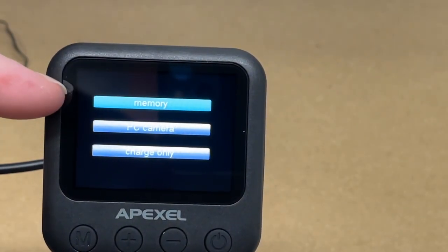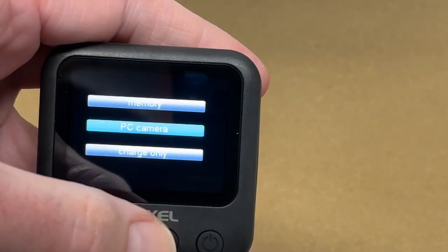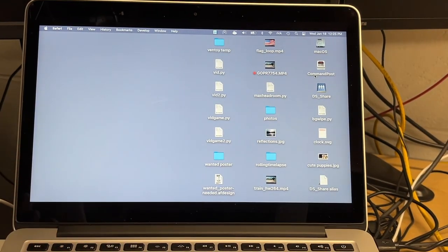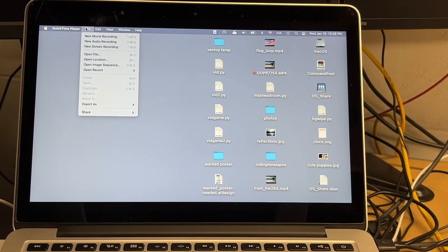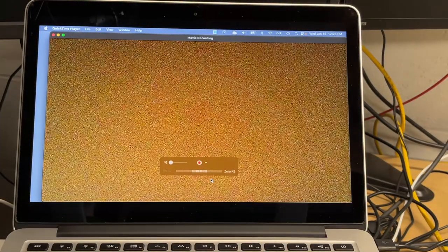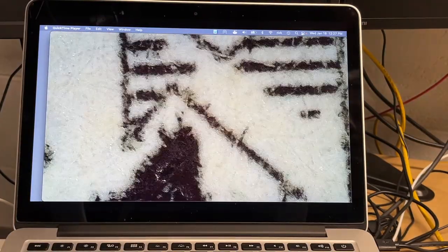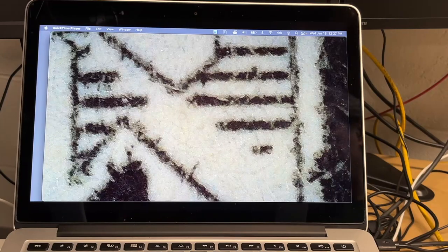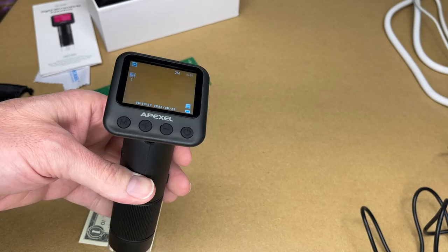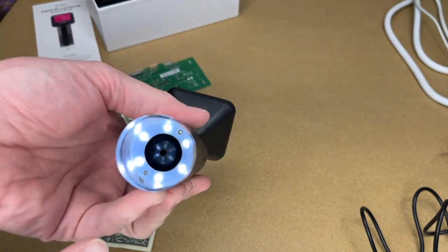I'm going to try connecting this to a computer now. I plugged it in and it gives me three options: memory, PC camera, and charge only. I want to go to PC camera — this will turn it into a webcam. I'm using a Mac, but you could do a similar thing with a PC. I'll open QuickTime, go to File, then New Movie Recording, and select USB camera. Now I'm looking at that money under the microscope.